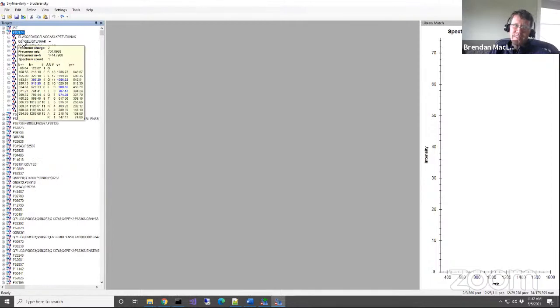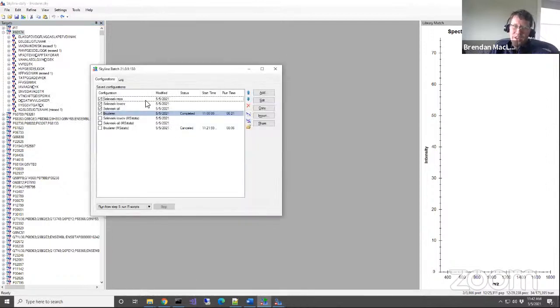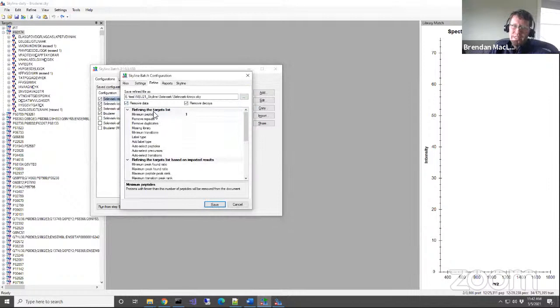We didn't do this in the experiment, but we're doing refinement, and what we've come up with is maximum precursor only, CV above cutoff, doing equalized medians, detected in 4 replicates. So this is a whole refinement experiment. We could have also said, where is it?